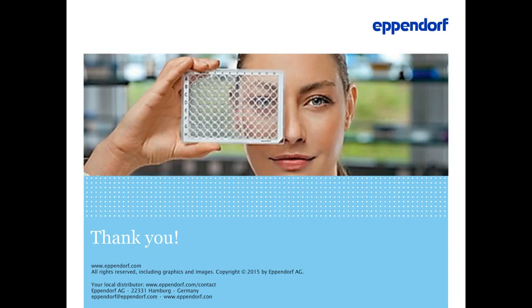The next person thanks you very much for your informative talk and says they actually have the other side of the problem, with samples, especially low concentration ones, getting absorbed by plastics. Do you plan to have another talk to cover this aspect? Yeah, well, it's a pretty well-known phenomenon. Biomolecules, proteins, nucleic acids bind to the surface of a plastic, typically polypropylene, due to certain hydrophobic domains which these molecules contain. And upon binding, of course, first of all you have less material, and second, there is certain denaturation and a loss of activity. We have a certain class of consumables, so-called low binds, which addresses this problem.